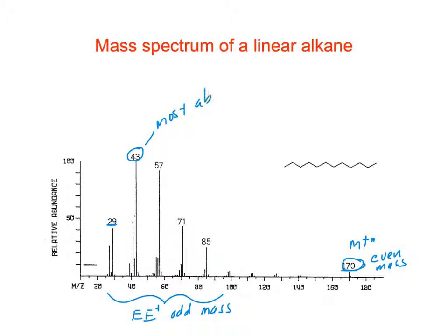We call this the base peak. The base peak is always set at 100%, so they just adjust it to put that one at 100%.